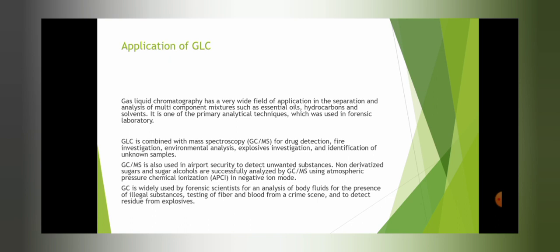The second application is that GC is used in airport security to detect unwanted substances. Non-derivatized sugars and sugar alcohols are successfully analyzed by GC using atmospheric pressure chemical ionization, APCI in short, in negative ion mode.